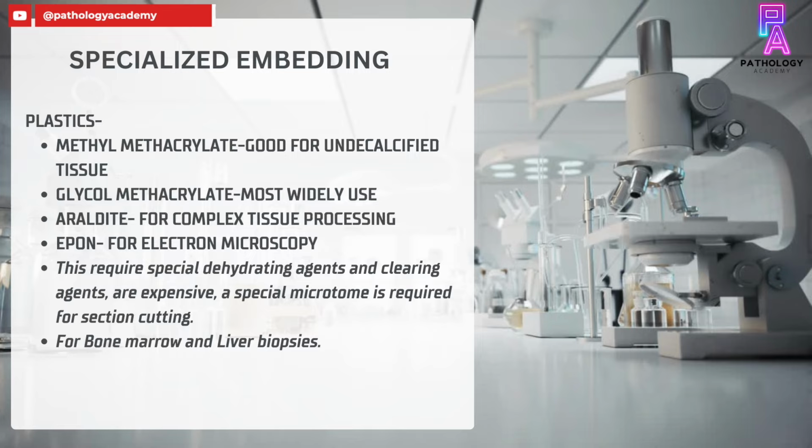This specialized embedding requires special dehydrating agents and clearing agents, which are expensive. A special microtome is also required for section cutting.